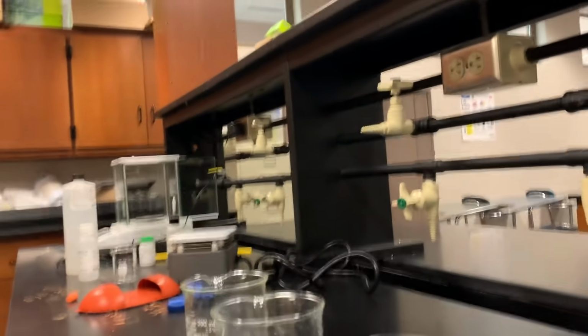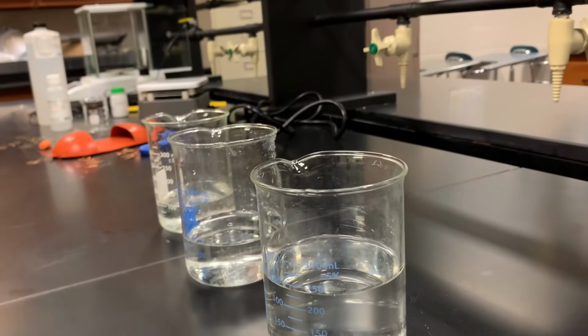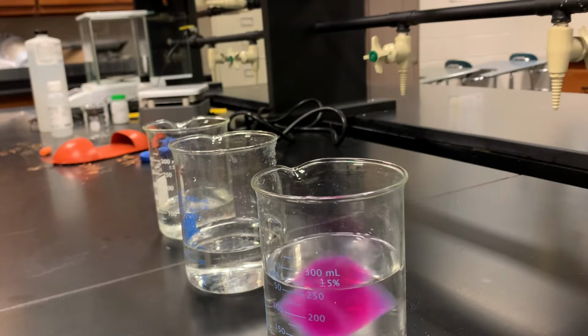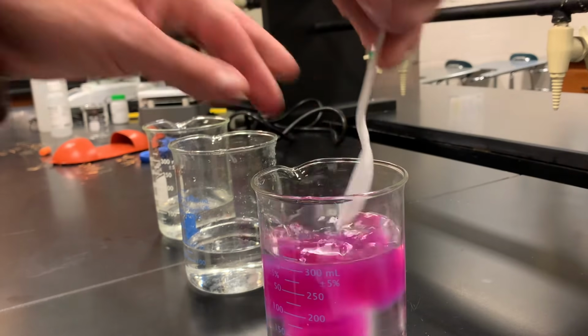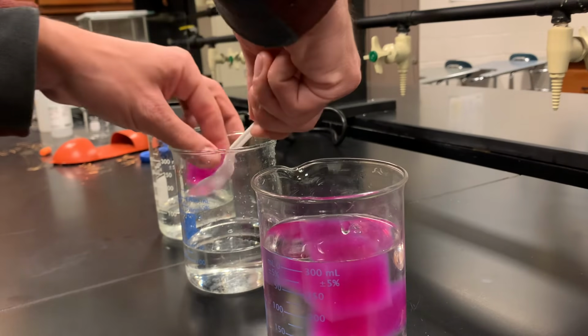So, to the best of my ability, we want to do these roughly at about the same time, which is not going to happen. So a little bit of experimental error on my part, but I'm going to drop these into the hydrochloric acid. Be nice if I had a lab partner here, but with the pandemic and everything, that kind of takes that out. Got to work alone.